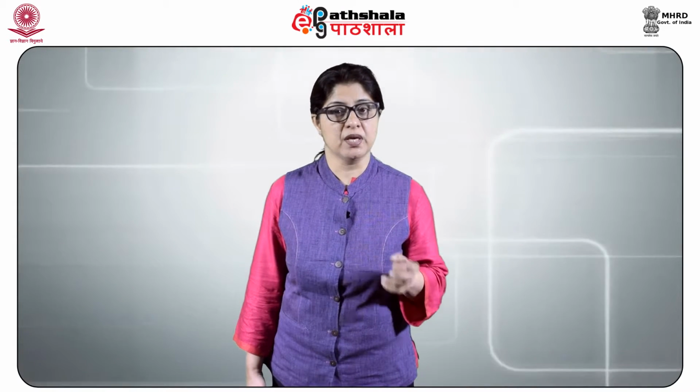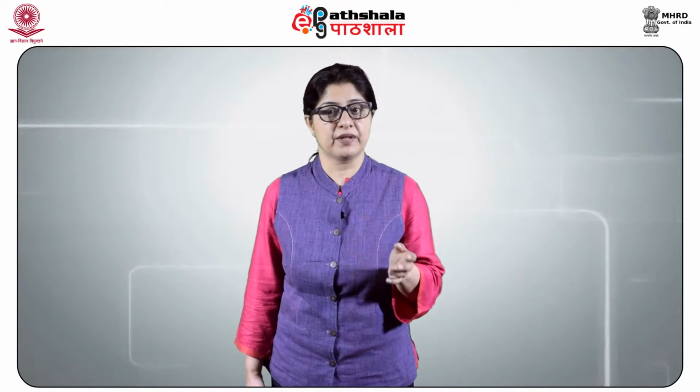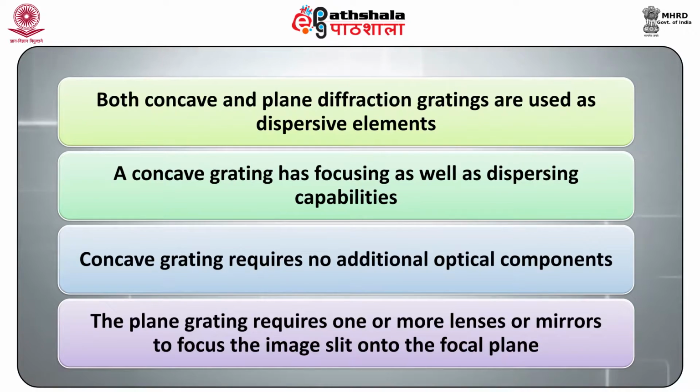High resolution, high luminosity monochromators are necessary to isolate the spectral line from its background without the loss of radiant power. Both concave and plane diffraction gratings are used as dispersive elements. A concave grating has focusing as well as dispersing capabilities. It requires no additional optical components, whereas the plane grating requires one or more lenses or mirrors to focus the image slit onto the focal plane.